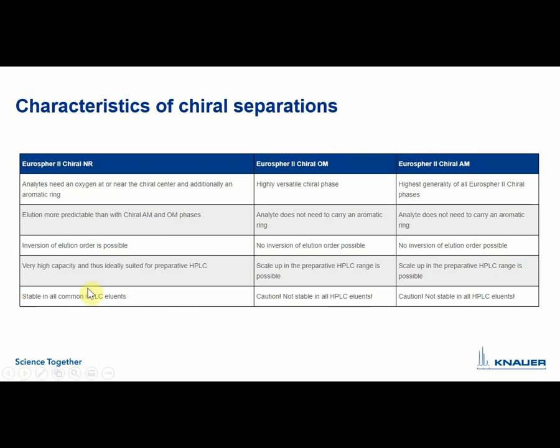So the NR is very stable in all eluents, and for these both phases you really have to be cautious. I can just say like it stays here. Caution, it is not stable in all eluents. So please familiarize yourself with the care and use of these columns to not destroy them.